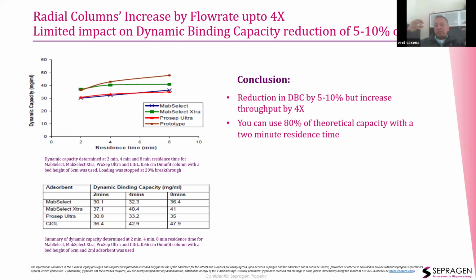Today, and that's because the binding sites were located inside the bead, and it took time for the protein molecules to diffuse into the bead and come out. The mass transfer limitations are very high.